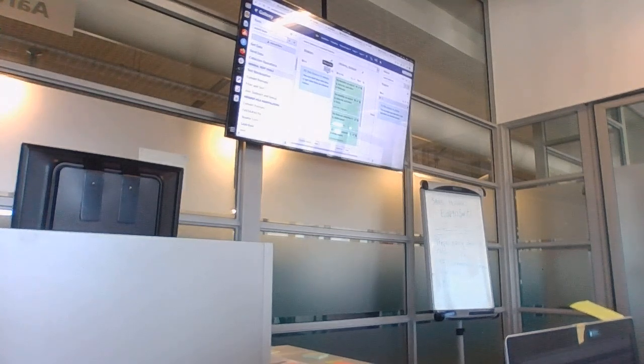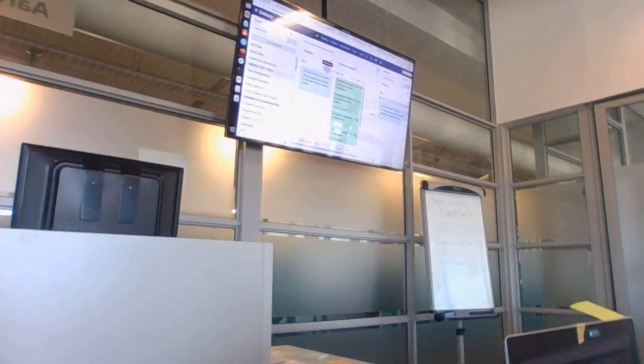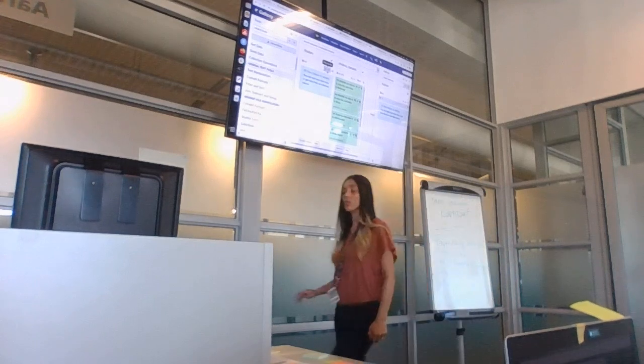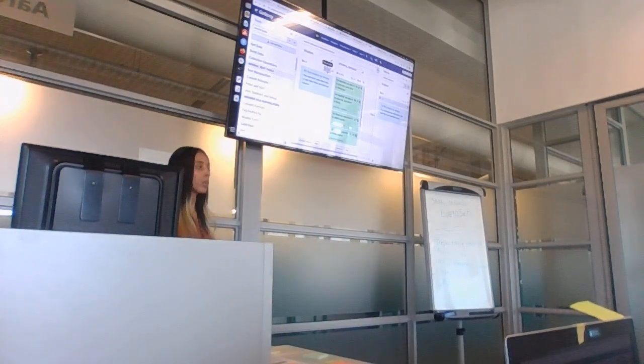So in the one block, you can click to put Kraken in there, and in the other block, you need to click switch to. If you're able to see two views like this, please put up a green tick.